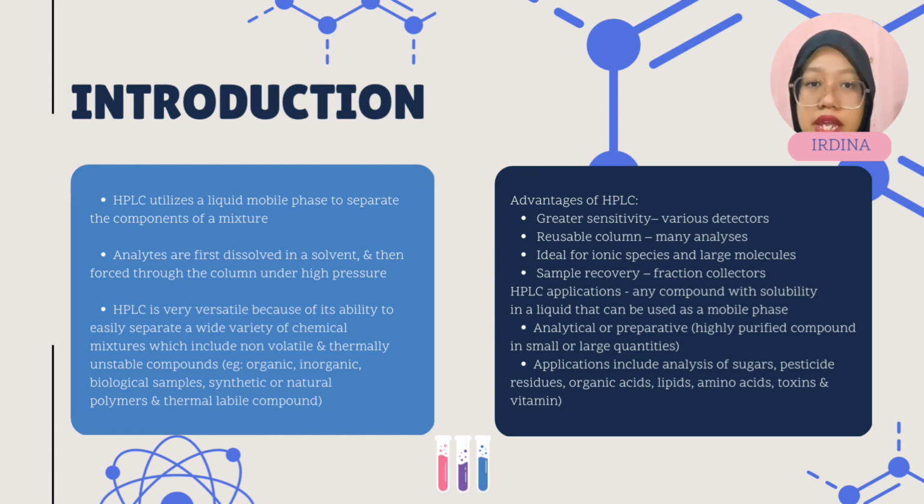HPLC application: any compound with solubility in a liquid that can be used as mobile phase, analytical or preparative, highly purified compound in small or large quantities. Applications include analysis of sugars, pesticide residue, organic acid, lipid, amino acid, toxin, and vitamin.